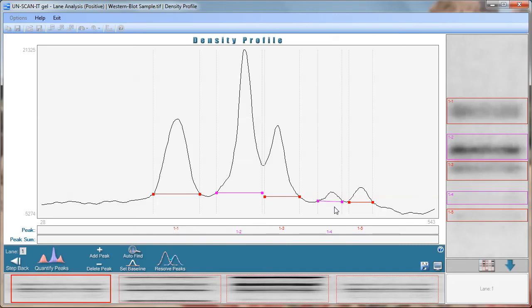The end points of each of the peak baselines should be located at the local minima at the edges of the peaks. You can use your mouse to drag the baselines to the desired locations.